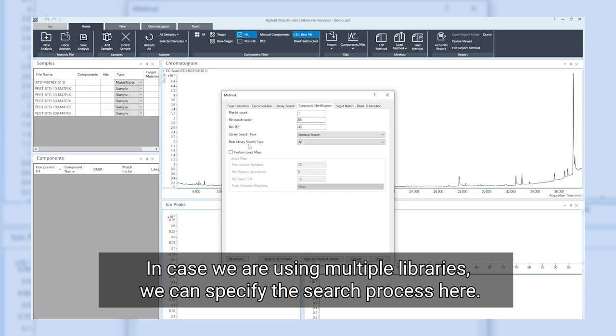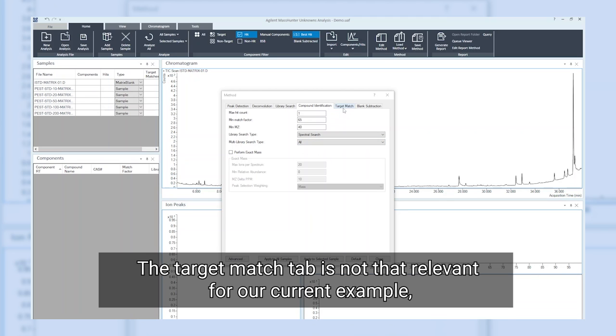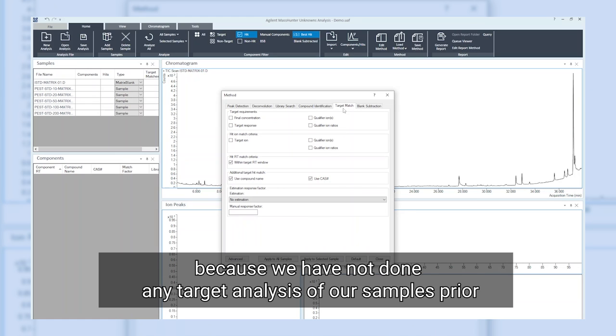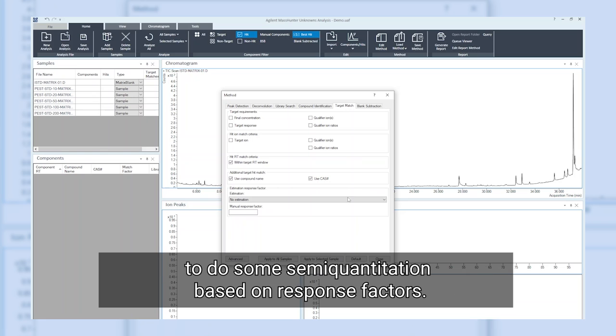In case we're using multiple libraries, we can specify the search process here. The target match tab is not that relevant for our current example because we have not done any target analysis of our samples prior to entering the unknowns analysis software, but it would give us the possibility to do some semi-quantitation based on response factor.